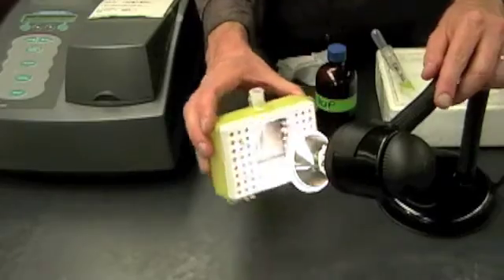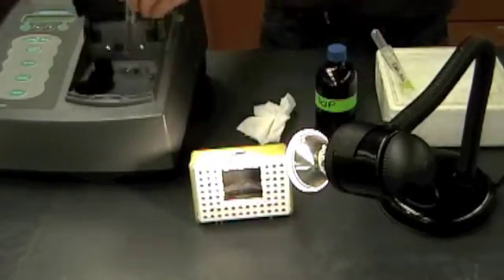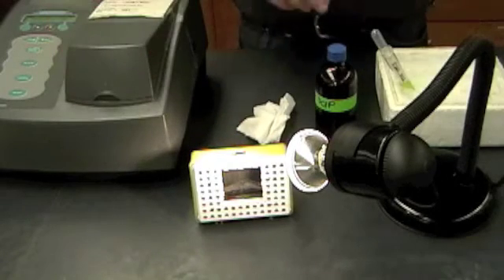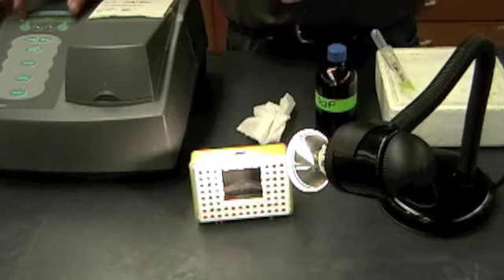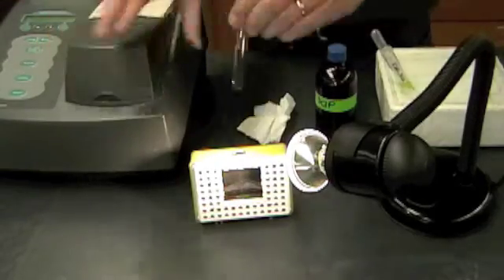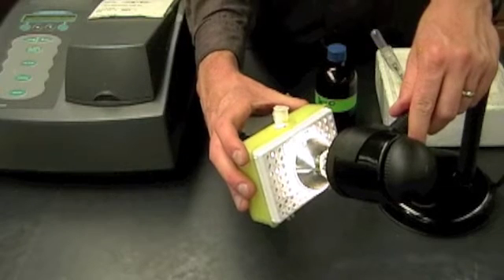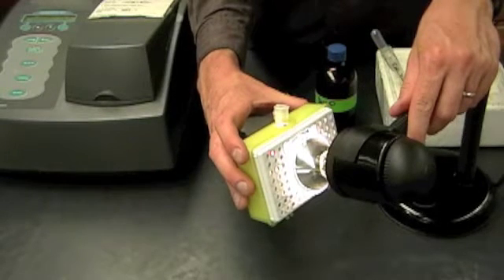One minute's almost up, so I'm going to take this down, pick it up, mix it quickly, wipe off any fingerprints, and get a spectrophotometer reading. Don't wait for the reading to stop because it's going to be changing as it goes. Once you have the spec reading, this goes back in the chamber and back up at the light for another minute. You're going to take readings every minute for 10 minutes.